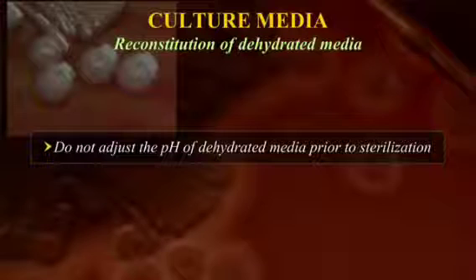Do not adjust the pH of dehydrated media prior to sterilization. The pH of the dehydrated media is adjusted by the manufacturer so that after the medium is prepared, the pH of the prepared medium matches with the label specifications given by the manufacturer.